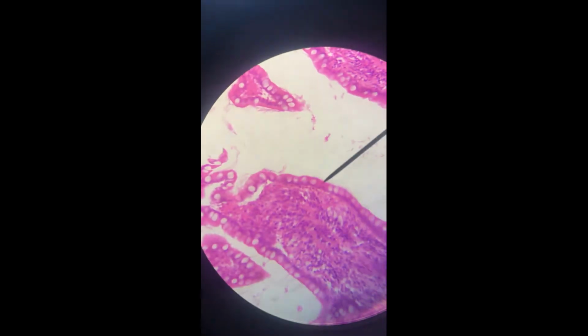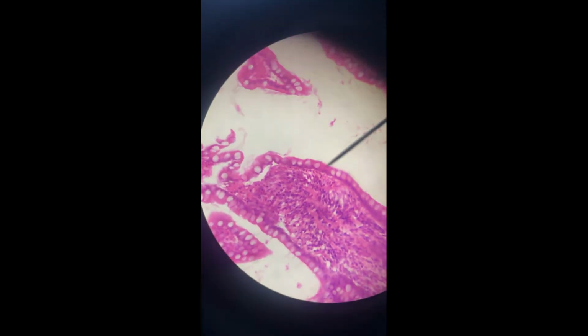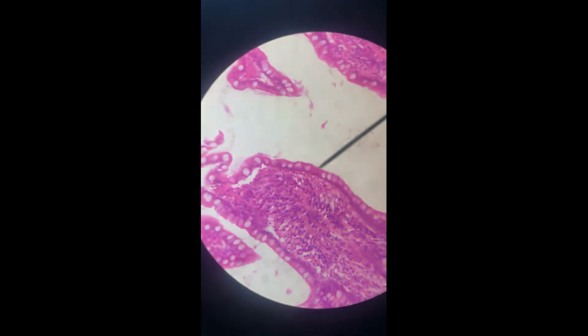But can you guess how many cells are in this slide? At least 200. So if you come to the lab practical and the pointer is at a place like right there, oh man. Where you say I can't see anything but the reflection on your phone. Right? There. I guess that's plasma membrane is best. I was hoping that I could move it.